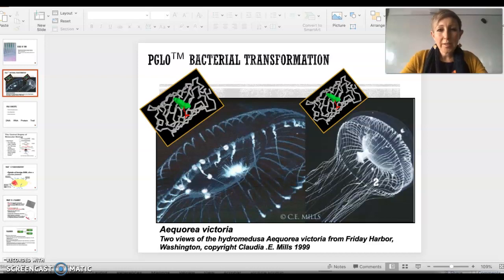Okay, so this video is just to run you through some of the theory behind the pGlo experiment that we're doing in Units 3, 4 Biology this year. You may use this as part of your revision: watch, rewind, and make sure that you understand the content, the process and the method that we've used, and some of the risks involved in the actual process.